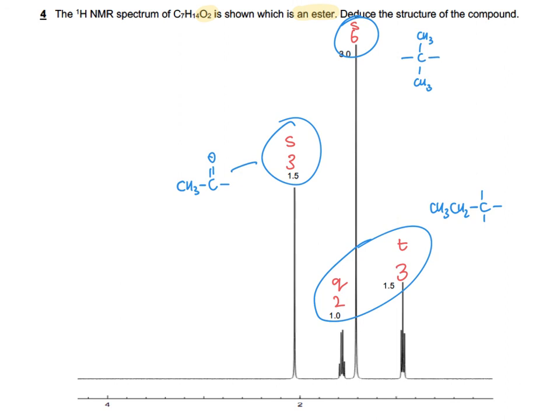And then if I count up how many carbons I've used at this point, 1, 2, 3, 4, 5, 6, 7. Well, that's actually all of the carbons. How many oxygens have I used? Well, I've actually only used 1, but I should have probably made a point of this earlier: I know it's an ester, so as soon as I had my carbonyl, I should have had my other oxygen there.